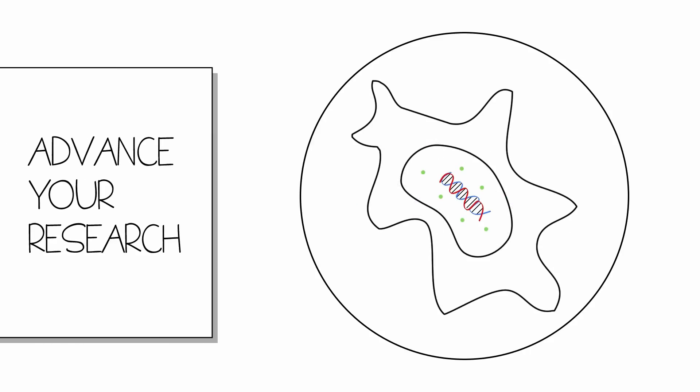You can also advance your research by combining several photomanipulation modes in one experiment. For example, apply photo damage to the nucleus to induce DNA damage.